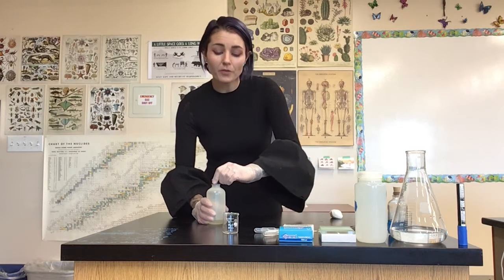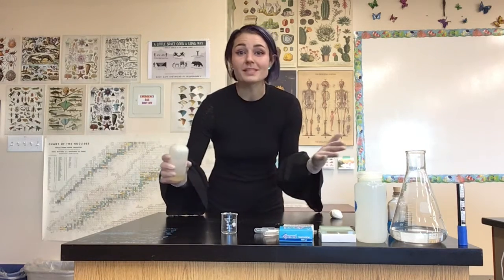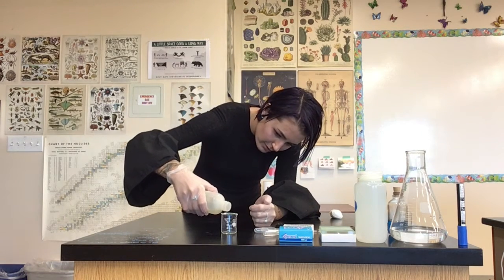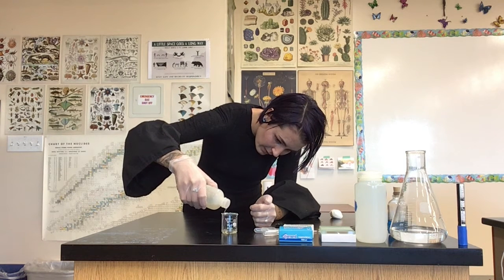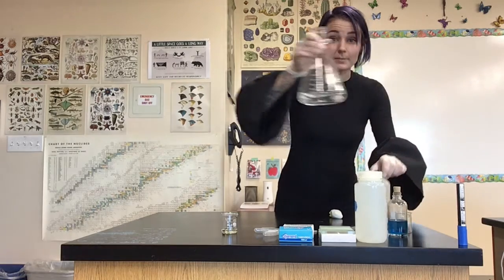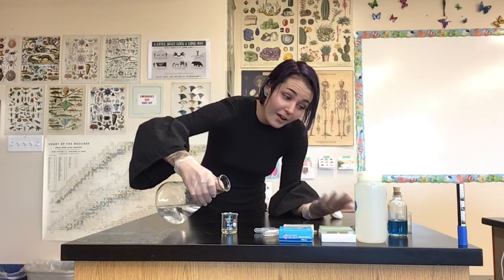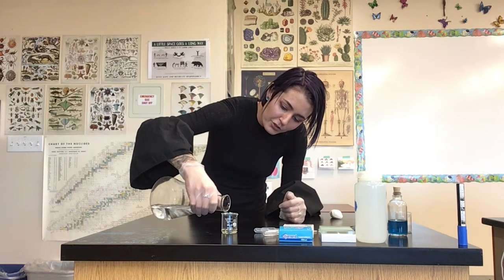So right now, what I'm going to do first is dilute my hydrogen chloride because I only need it to be at a molarity of 1, but the hydrogen chloride that I have in my classroom is at 3. So that just means that I'm going to dilute it 2 times. So I'm going to pour it out to the 10 milliliter mark. Okay, so I've got it at the 10 milliliter mark. And then I'm going to use some distilled water and pour it to the 30 milliliter mark. So it's 1 part of the hydrogen chloride and 2 parts water, which means it'll be diluted from a 3 to a 1.